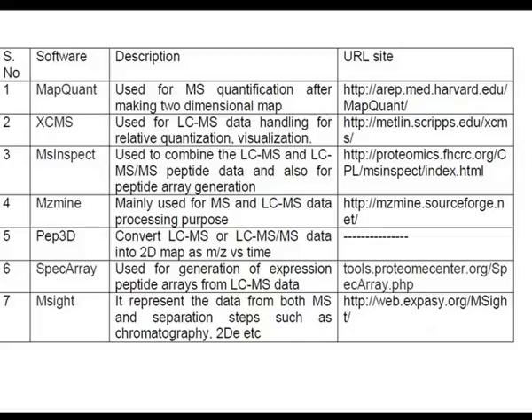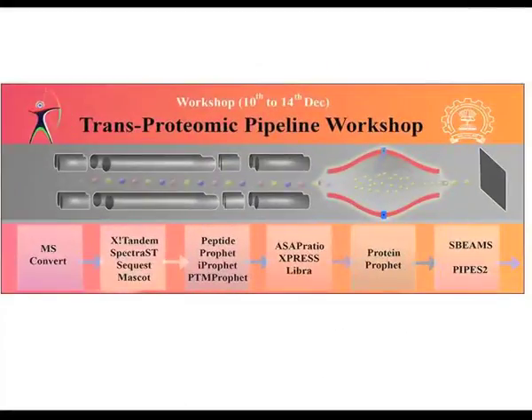Mascot is the widely used and trusted search engine for mass spectrometry data analysis. It has a comprehensive database covering various organisms and is compatible with all existing mass spectrometry softwares. Besides Sequest, X!Tandem is also used for MS data analysis. In addition to vendor-specific tools and databases, there are many online open source data analysis software.